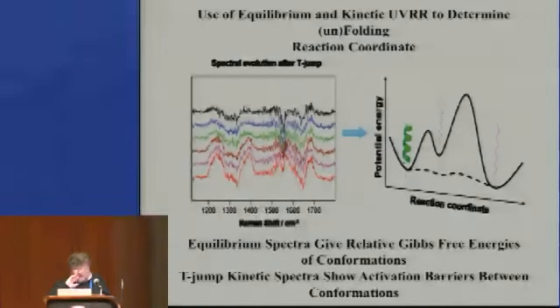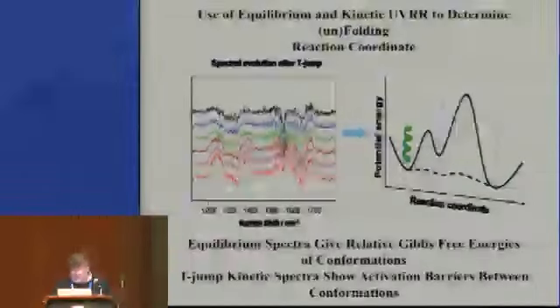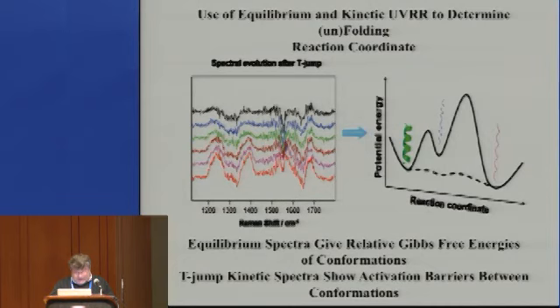What I'm now going to tell you about is something I'm talking about for the first time, and that is looking at the energy landscape in order to find mechanistic information about fibrillization. And so what we're going to do is we're going to take a look at the different conformations that can exist and try to understand how you can go from monomer solution conformation to aggregates, to fibrils.